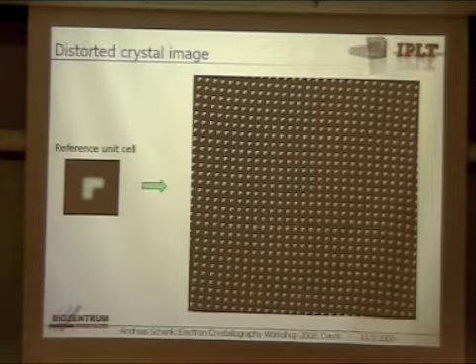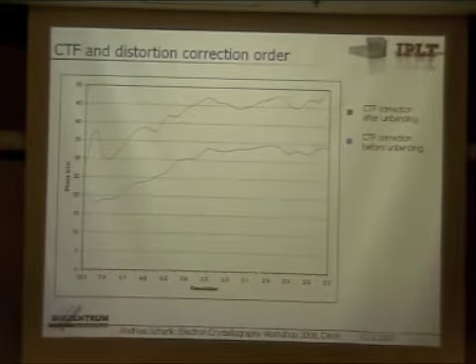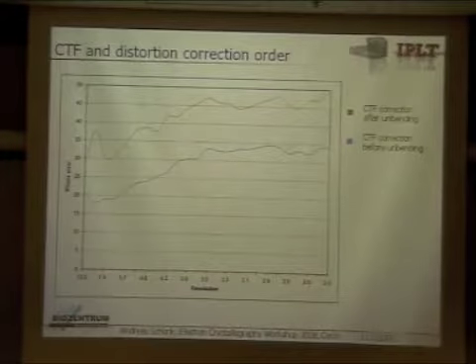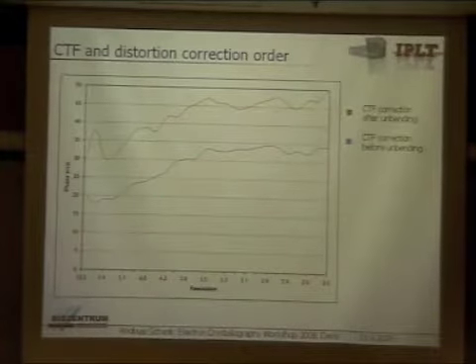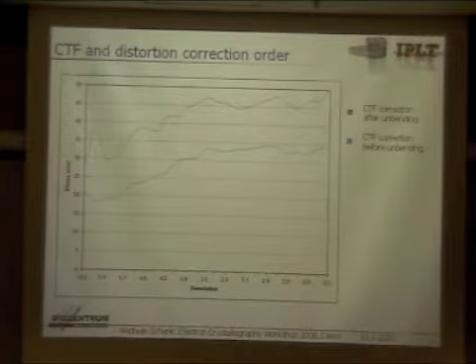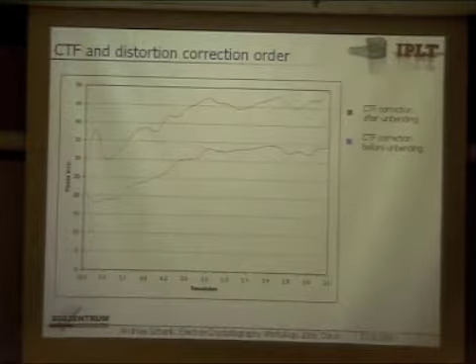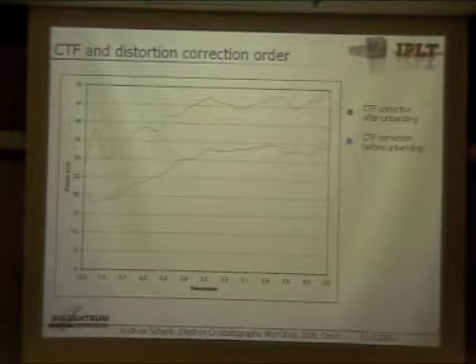You can determine these, load them in here, use this real distortion, and simulate again. That's definitely something I want to do. Then I can probably tell more about the magnitude. But with different, smaller distortions the trend is the same; the magnitude depends on the distortion you have.